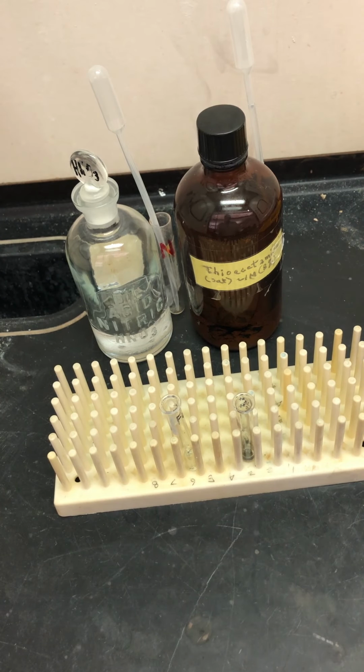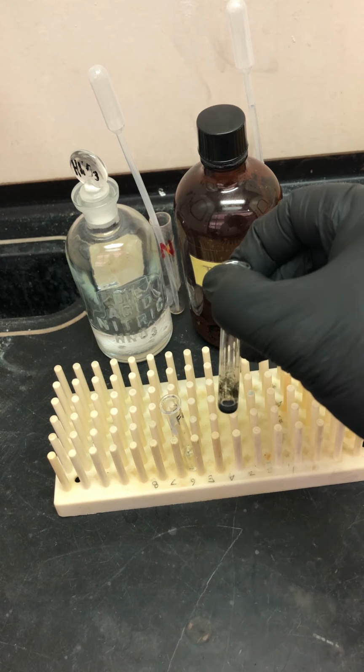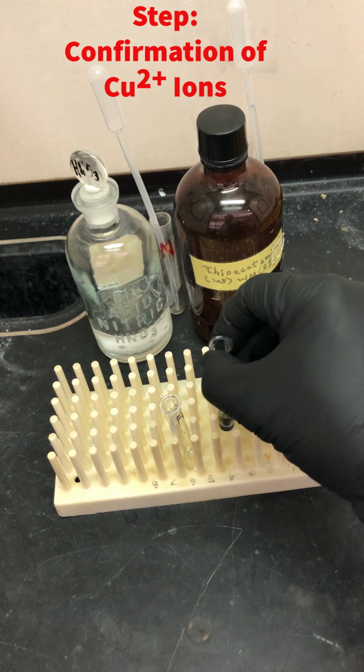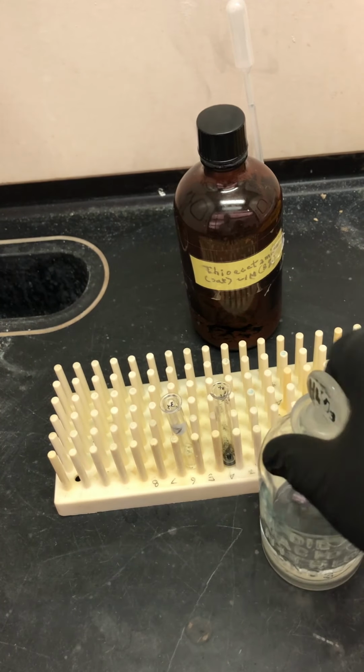Okay, we're still in the fume hood here because we still have some sulfides in the atmosphere. And we have our pellet of copper 2 sulfide in here. But as we explained a little while ago, we need to confirm it. So what we're going to do is take some nitric acid. Again, I brought it into the fume hood also.